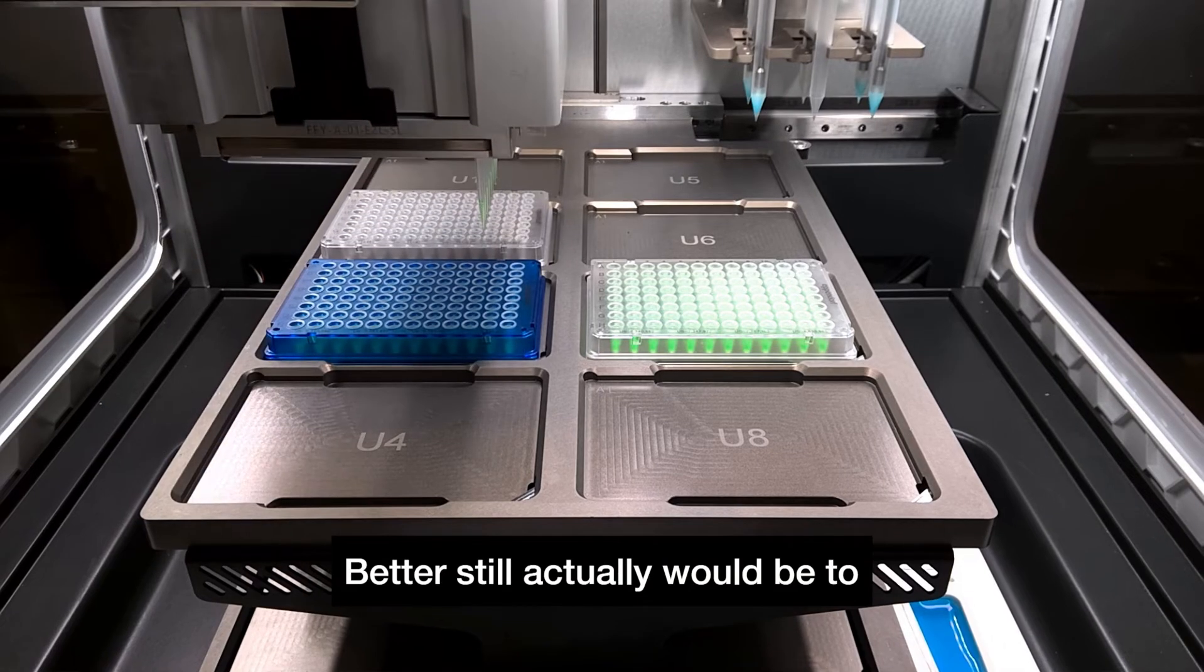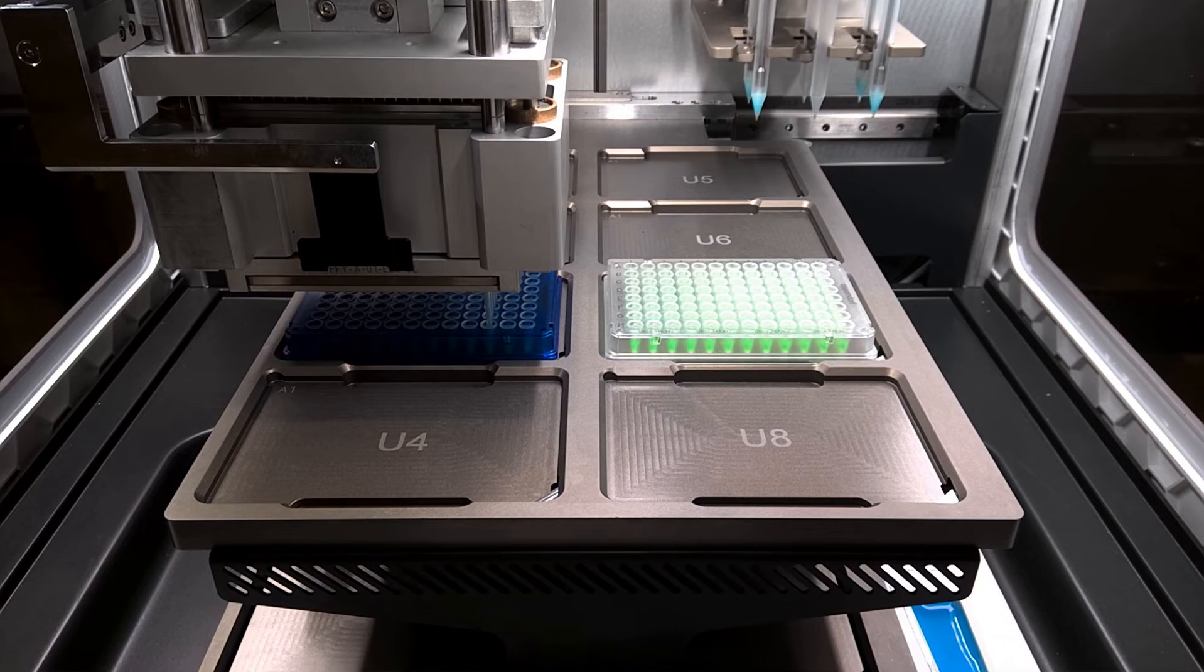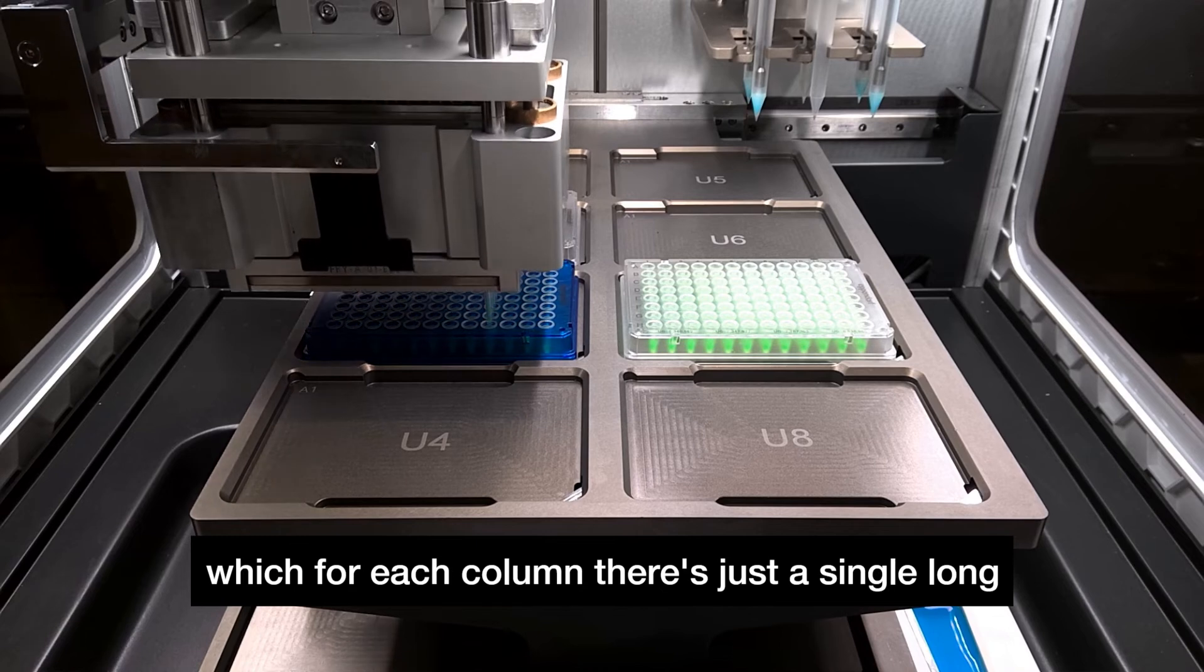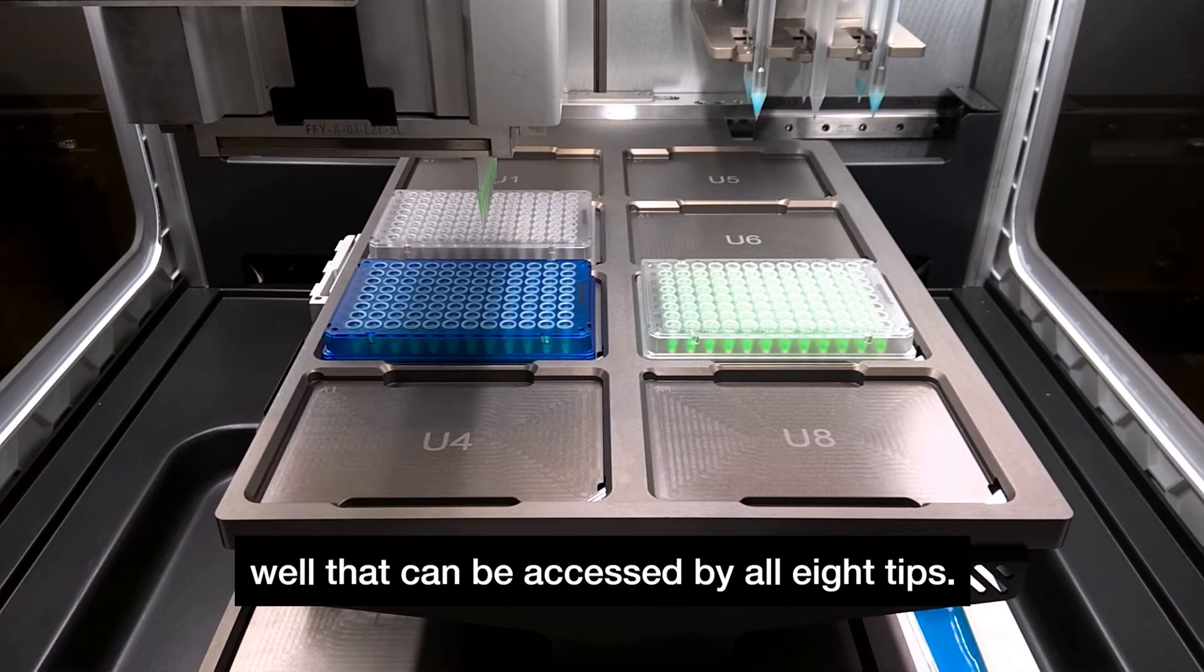Better still actually would be to use a single well column bit of labware. You can get plates which for each column there's just a single long well that can be accessed by all eight tips.